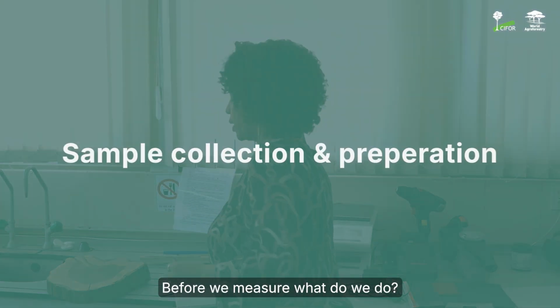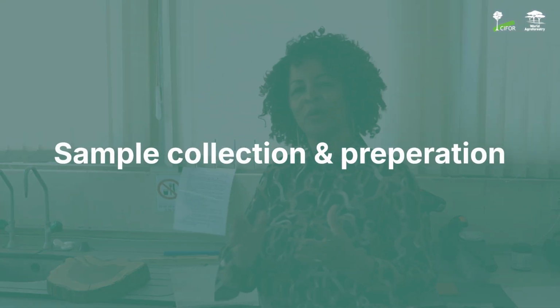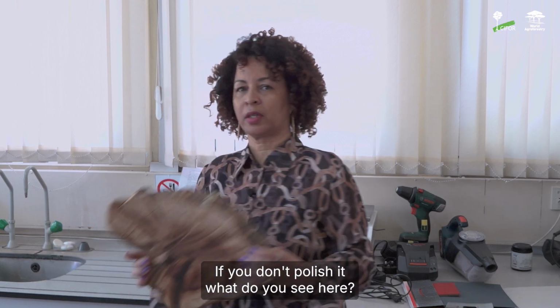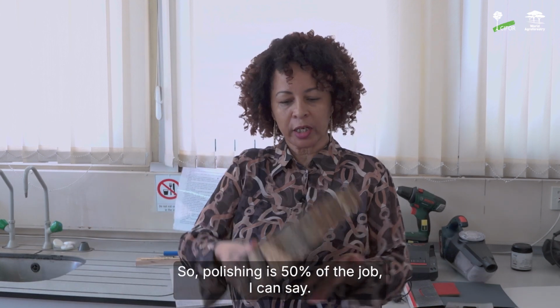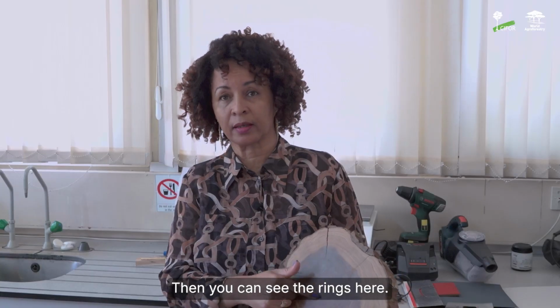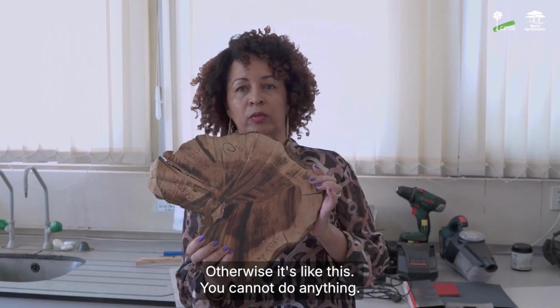Before we measure, what do we do? We polish it, because this is critical. If you don't polish it, what do you see here? Nothing. So polishing is 50% of the job, I can say. Then you can see the rings here. Otherwise, it's like this, you cannot do anything.